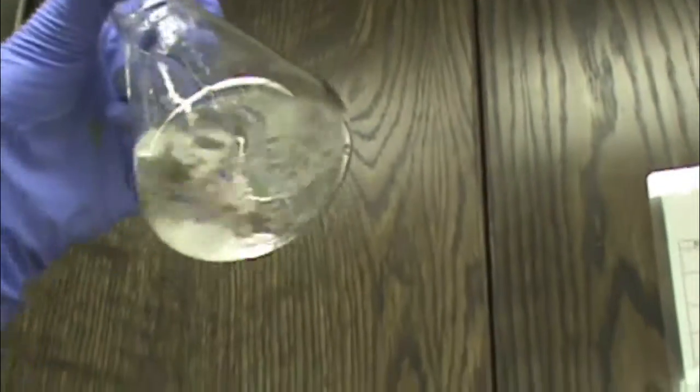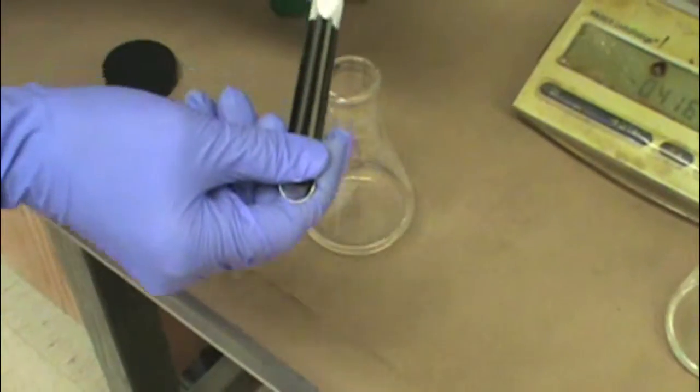If you look underneath your Erlenmeyer flask, you see that all of the sodium sulfate has clumped in one spot. That means we need to add another scoop.